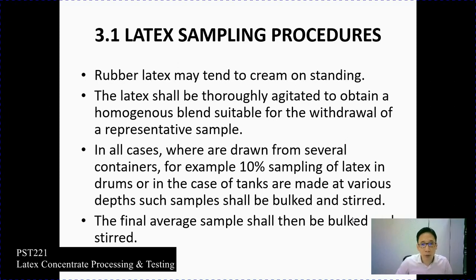Okay, I think I will go through a bit fast about this because I think this is the third time I did mention about the latex sampling procedure. Initially I did mention about this process during chapter 1, and then we go through with chapter 2. I explain a bit details, and here I just do some revisions and some reminder during latex sampling procedure.